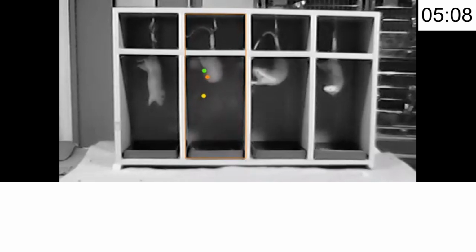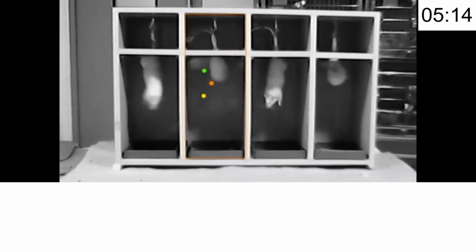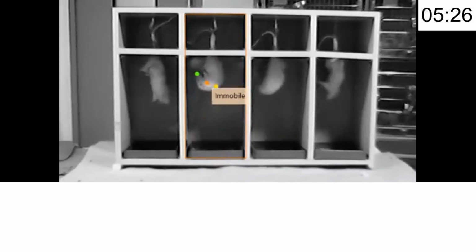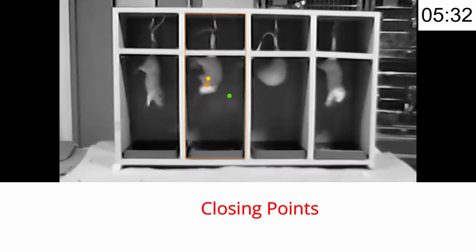If you are not using any instruments, you have to watch each and every animal very carefully, and while you are using multiple-compartment enclosures, it is impossible to watch each and every animal at once. So an automated tracking system is necessary.